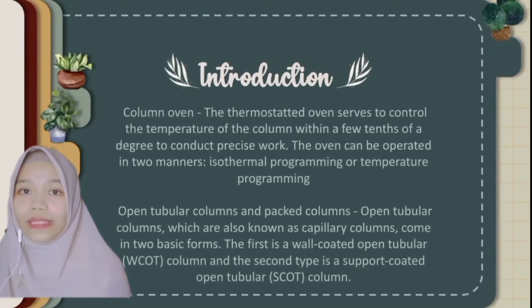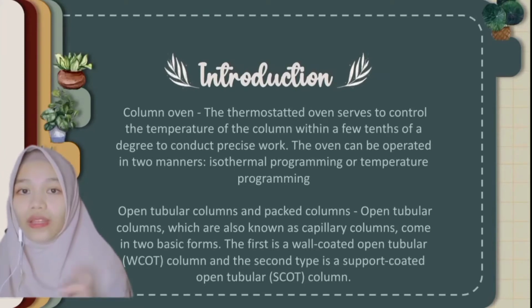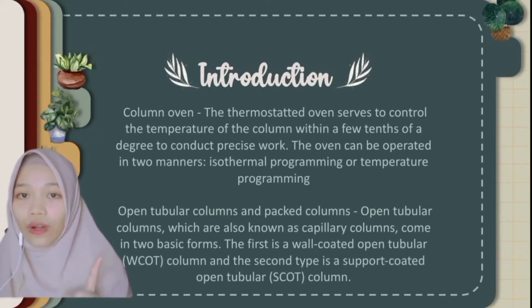Third is the column oven. The thermostated oven serves to control the temperature of the column within a few tenths of a degree to conduct precise work. The oven can be operated in two manners. First is isothermal program, or second is temperature programming.